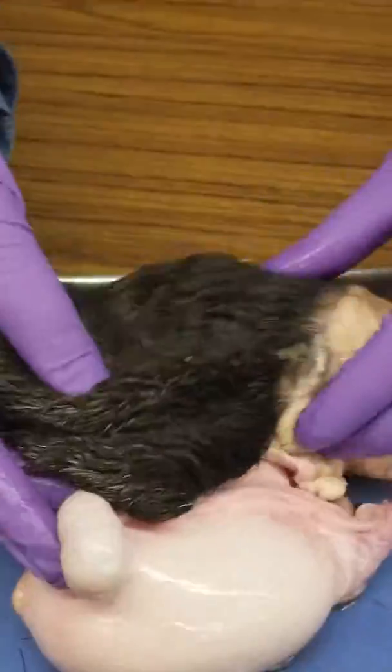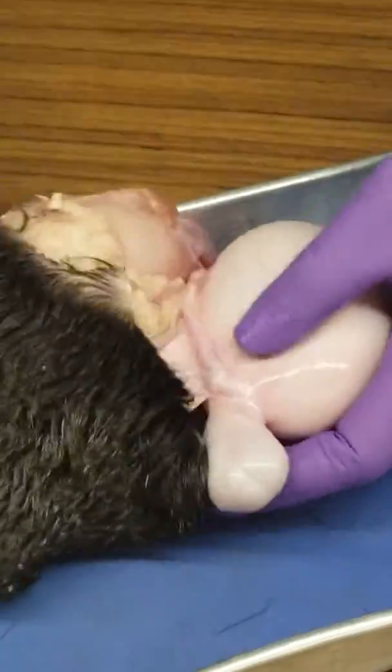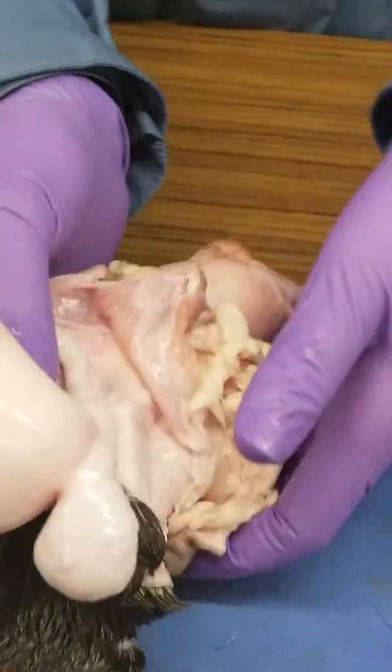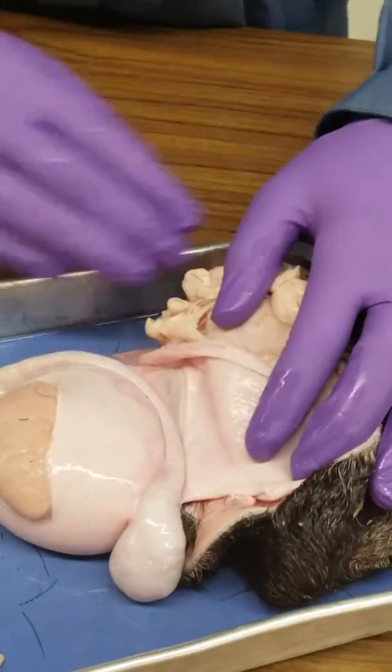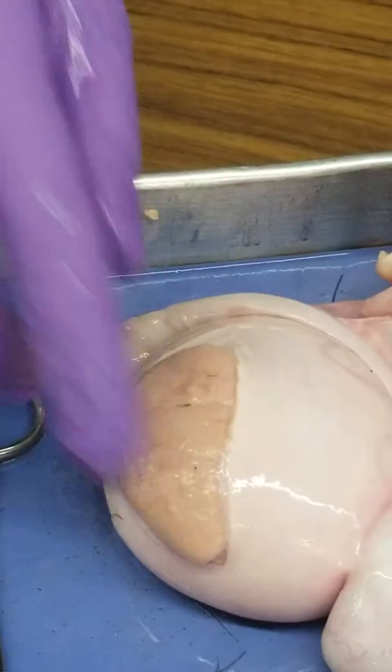We're looking at bull testes. Here's one testis and there's another testis. On this side, this is a ruptured testes — these are the seminiferous tubules protruding out.